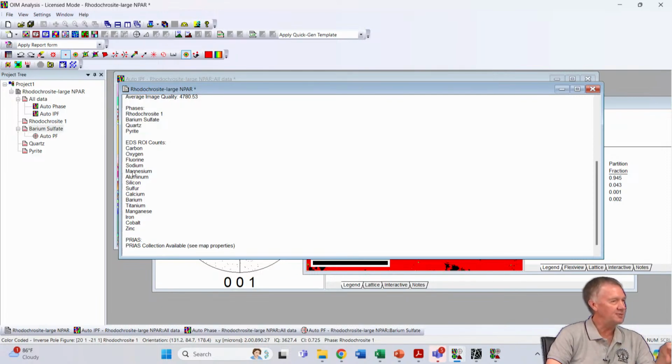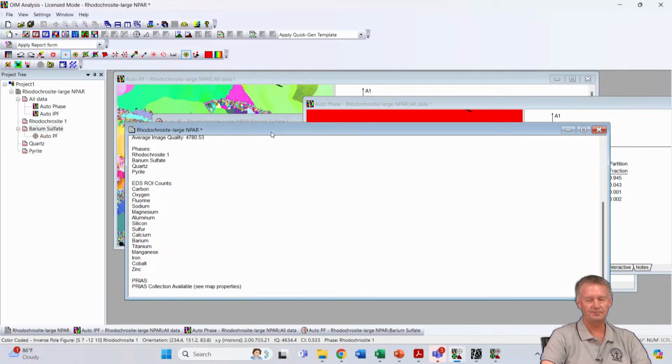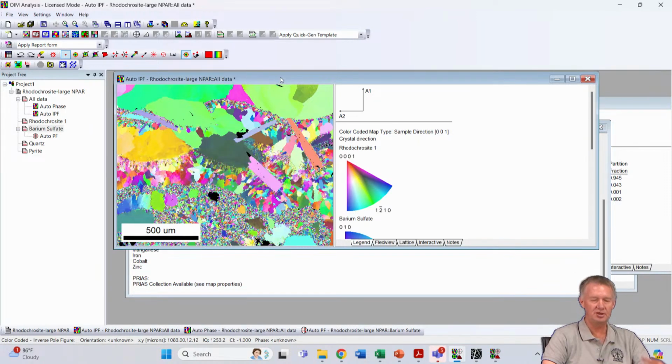And a lot of times we'll use that information to distinguish between phases as well. So if you have copper and nickel together, they're all FCC and they'll just index as FCC if you don't have the chemical information in addition. Right? So you need that sometimes to say that's a copper layer, that's an aluminum layer, that's a nickel layer, and that's a stainless steel layer or something that all look FCC. So sometimes you have to bring EDS in as well, but the data you can get, and you can do texture analysis on all the individual phases. Okay.